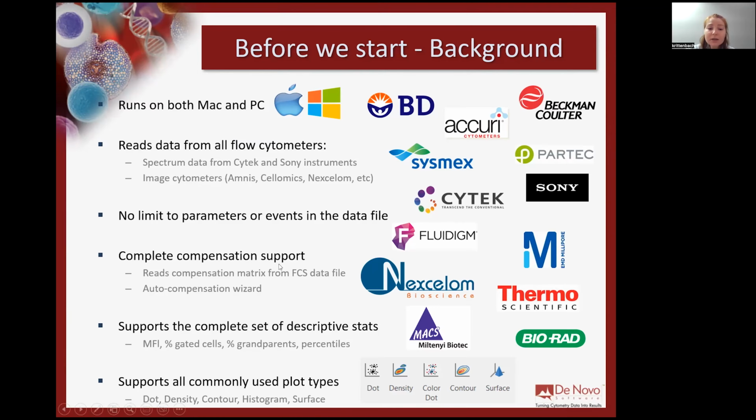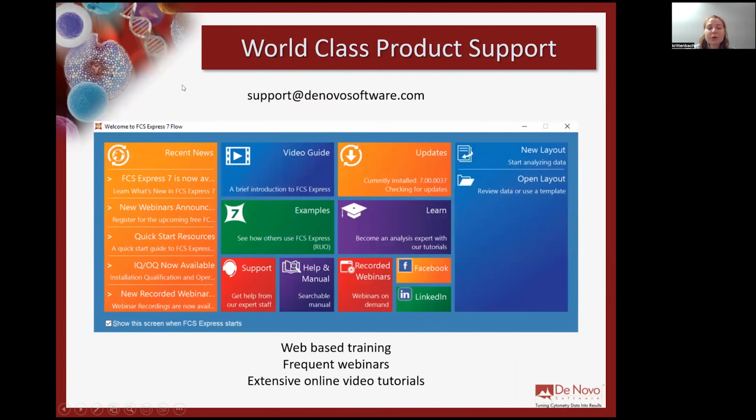If there's a tool or a feature that you're looking for and you can't quite find it, don't assume that it's not there. Please reach out to us. We're happy to help. We have a whole team of support experts, and we are always able to answer your questions.